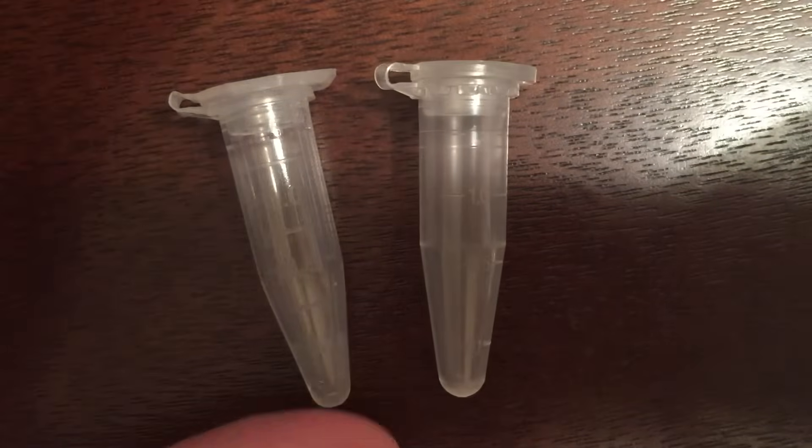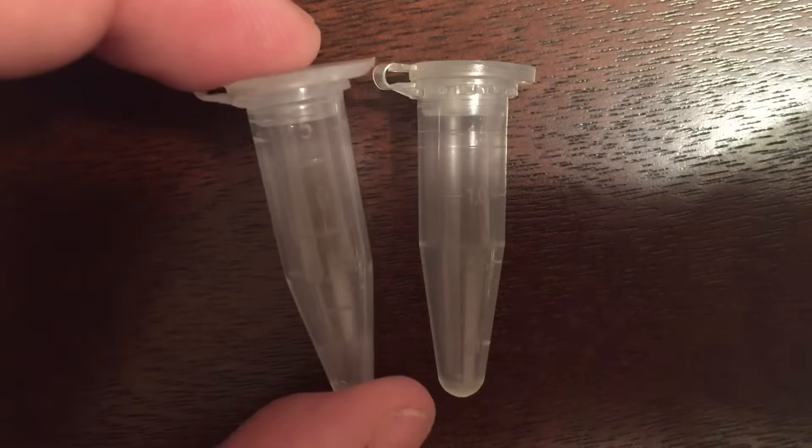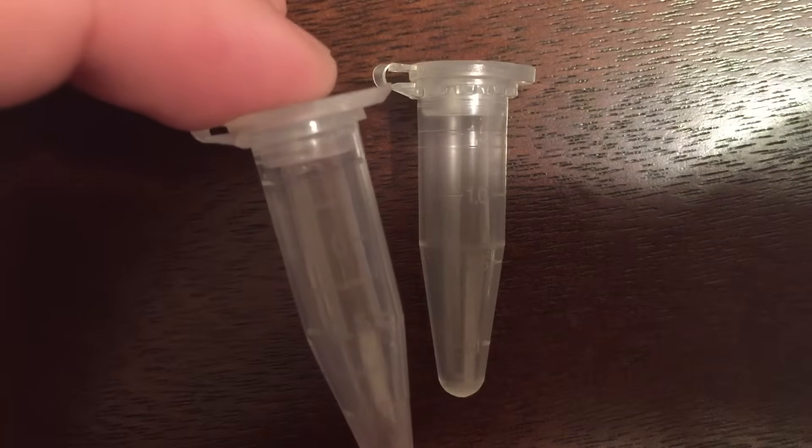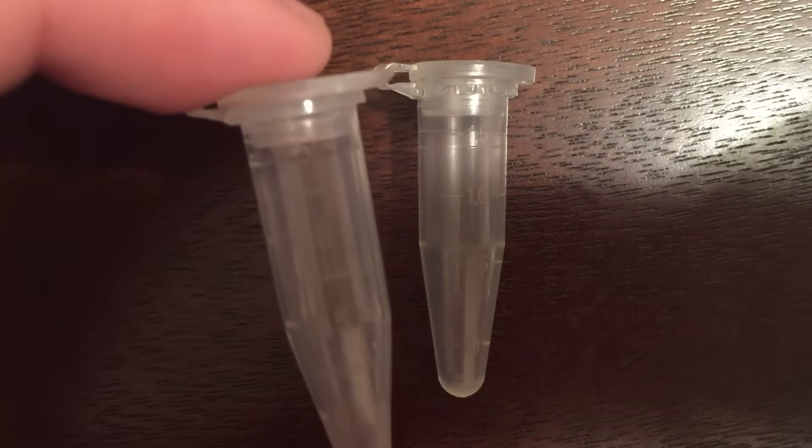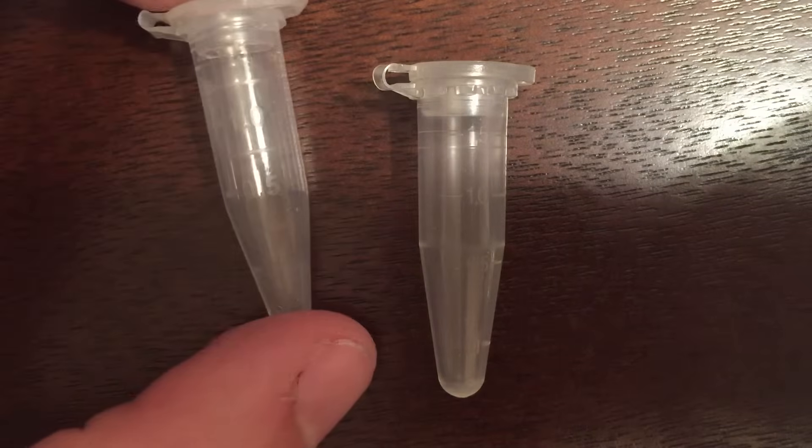The actual volume of this Brandtek tube is about 1.7 milliliters. On the other tube, it's actually harder to make out the graduation mark, but it's nearly at the same level as the end of the cap.